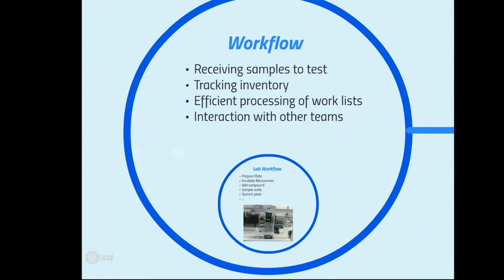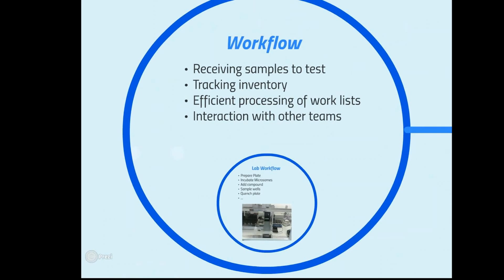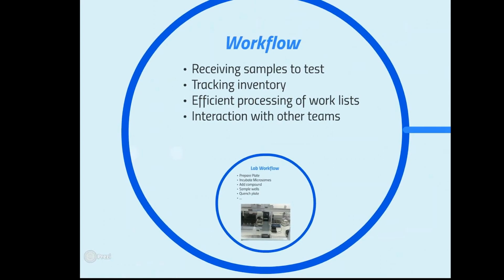Another challenge is managing the workflow. So obviously we've got to manage everything from receiving samples to tests, through tracking their inventory requirements, maybe ordering plates to be delivered, through the plate preparation process, and allowing you to efficiently process work lists, and also interact with different teams, whether it's an in vivo scientist dosing an animal and then taking biosamples that need to be analyzed by bioanalysis, or it could be formulation of a compound ready to be used in an assay.